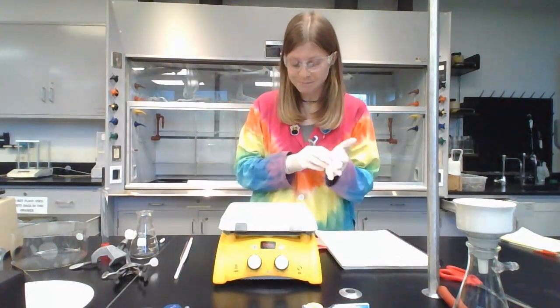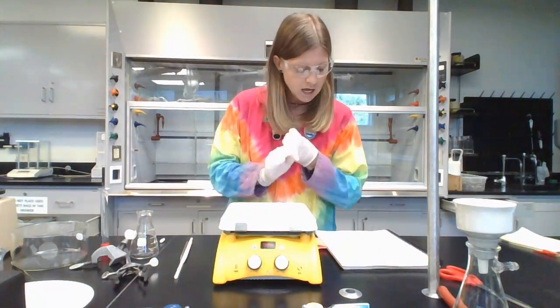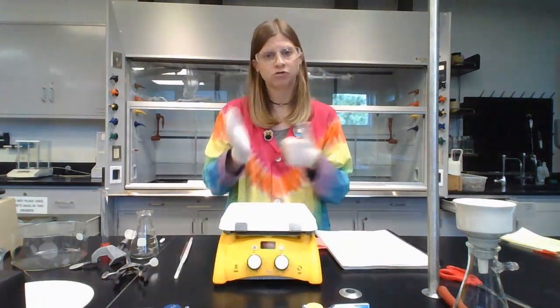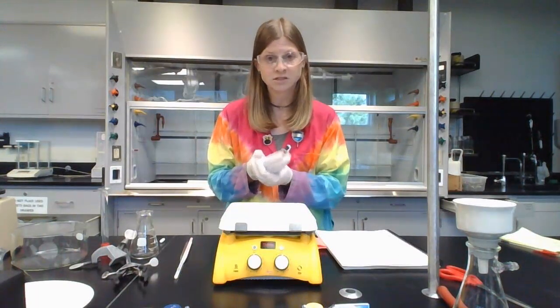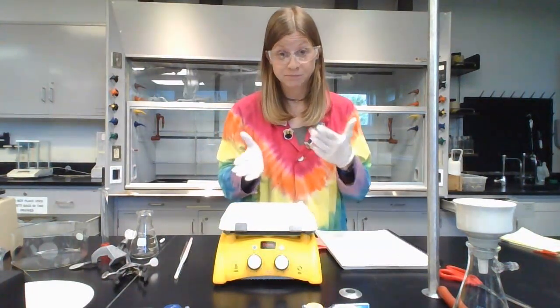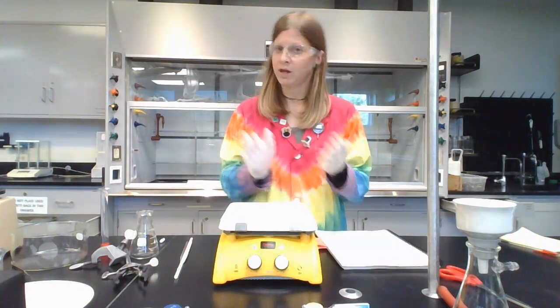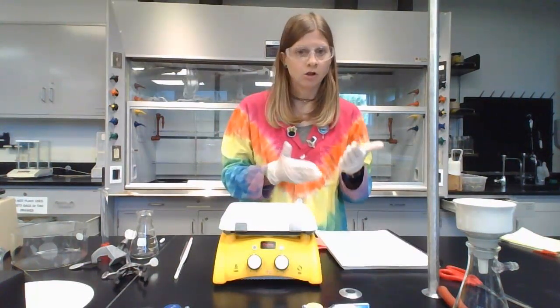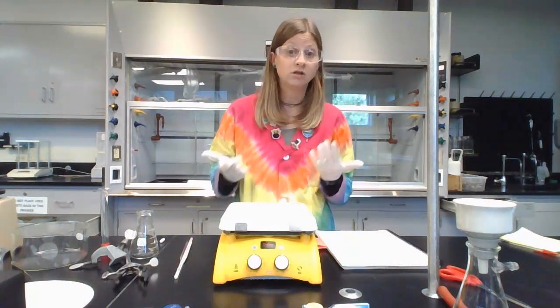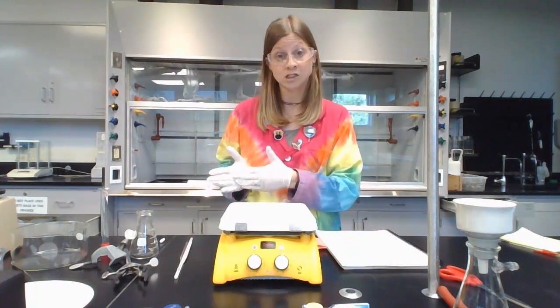Okay, so for this lab, we're going to be taking salicylic acid as our starting material, mixing it with some stuff, and hopefully creating aspirin, which is acetylsalicylic acid. So that's one part of the lab. Make the aspirin. Again, we start with a white solid and we end with a white solid. Looking at it with your eyeballs does not tell you whether or not you were successful in taking the salicylic acid and turning it into aspirin.